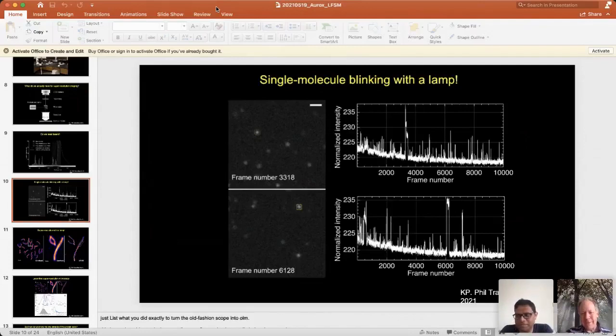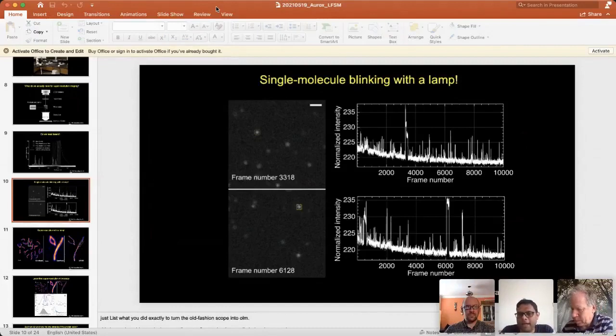Yeah, so basically, it's a long answer, Martin. Happy to chat on this. But again, these are classic triplet states and how you recover molecules and bring them back. If you think of photobleaching as a coma state, I think with these different wavelengths, you have different conformations of molecules, which you can bring back. And that's why even if you, let's say, bleached one conformation, you can bring back the other one. So I think these different wavelengths, let's say 350 nanometers, will reactivate in a very different manner than what 380 nanometer or 405 nanometer would do. I haven't probed this, but there are a lot of cool things, and I'm happy to show you some of the photophysics things I have done later on.